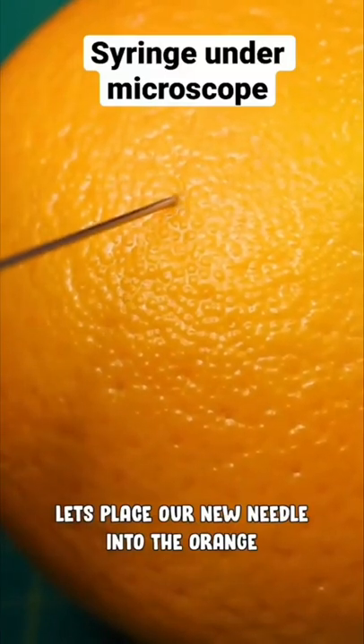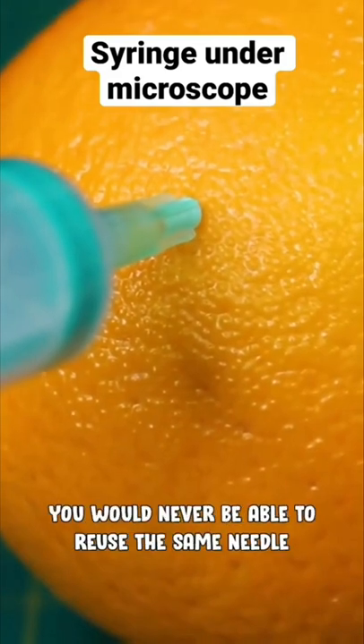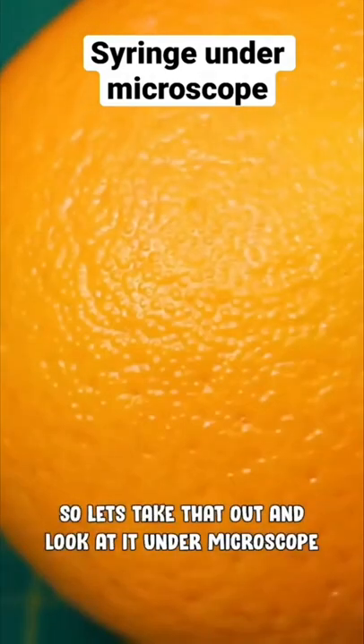So let's place our new needle into the orange very carefully. Okay, this is used now. You would never be able to reuse this same needle in any medicine. So let's take that out and look at it under the microscope.